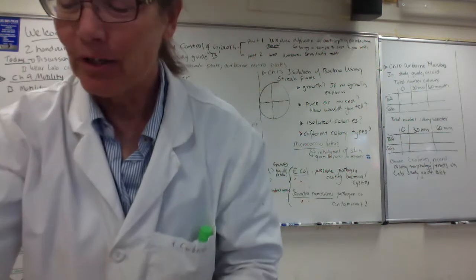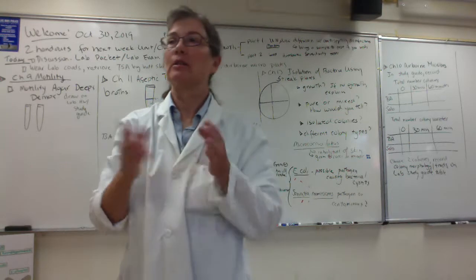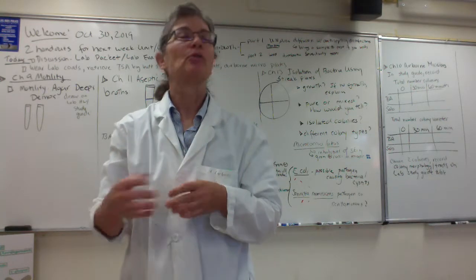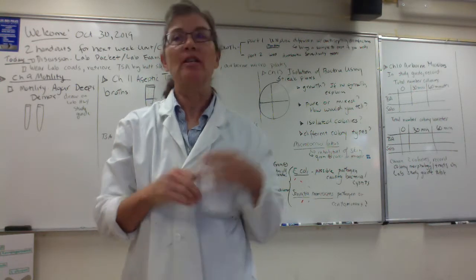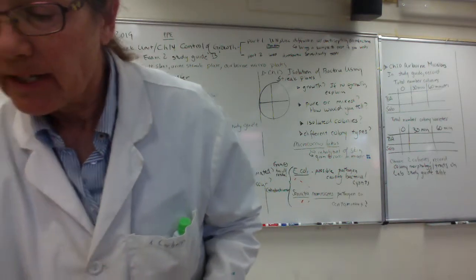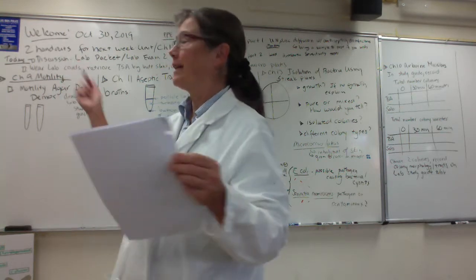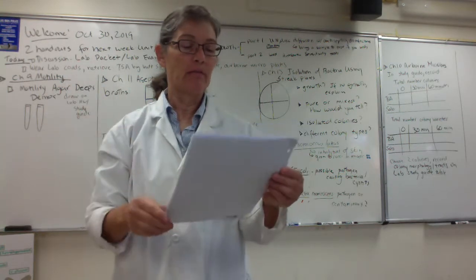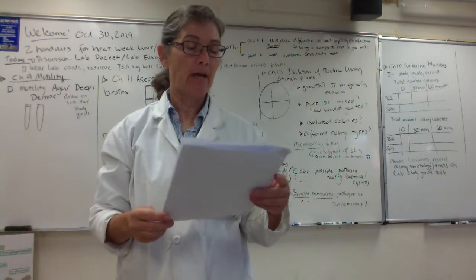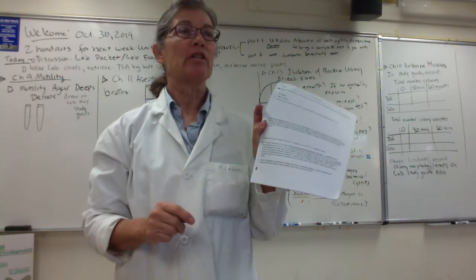Okay. So again, folks, we'd have photographs on the lab practical to ask you to interpret the motility agar deeps. Okay, so you guys okay with that one? All right. And so, folks, I'm going to flip back and forth between the lab study guide packet just to make sure we're covering all of the questions, okay?